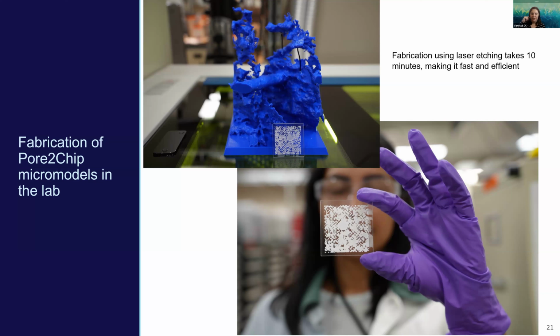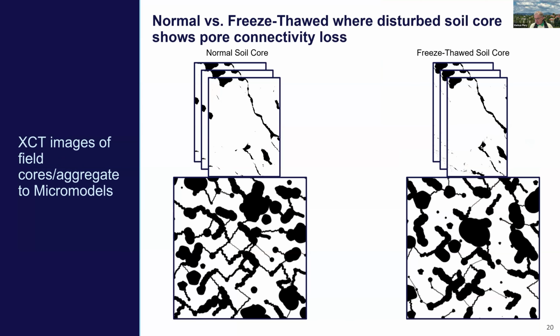Marcus, you have a question? Yes, that's very interesting. Thank you for those presentations. That's really cool. It struck me when I looked at those images that Arami showed with the XCT, you have those cross sections, and then you make the mapping of the 3D structure to the 2D, and those images look very different, right? And that's because you have those targets, the pore size, the throat size, and the coordination number that you showed.